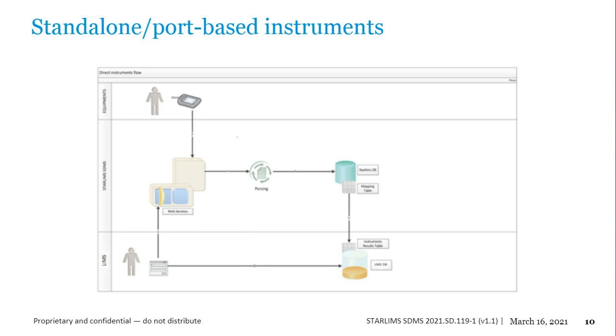Not only that, let's take a moment and think about where work usually happens in the laboratory. Have you ever started working on something in your desktop, on your bench, and then having to go to another area of the lab where all the balances are placed, to continue the work? At the same time, due to floor space, you might not have a desktop next to each one, so you can't do immediate transcription. So one of the challenges working with serial devices would be the portability of the solution. So you're not restricted to a single workstation, to do the mapping of the weight results or pH readings from a simple device, to the sample ID if you're working with a LIMS.